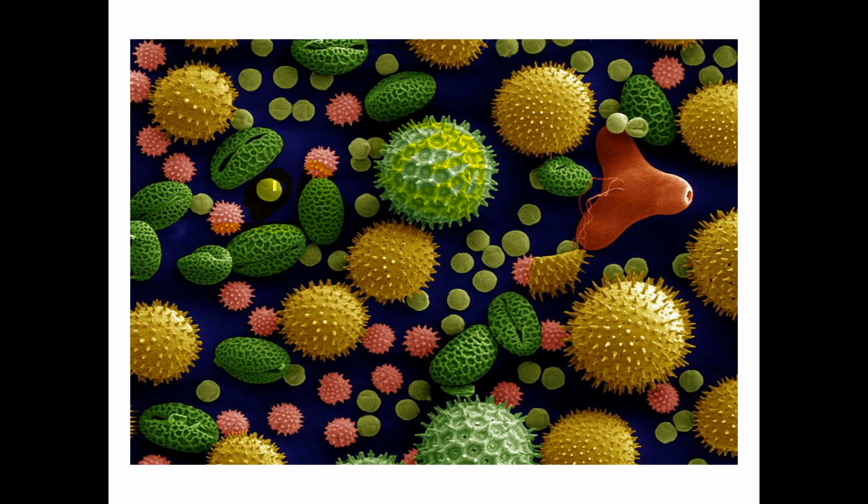Topography means how a specimen looks like. What are all the various structures we can see? The size of the structure, the shape of the structure, whether you have any surface structures, all those things will come together in topography. You can see from the picture, what is the topography of this specimen?